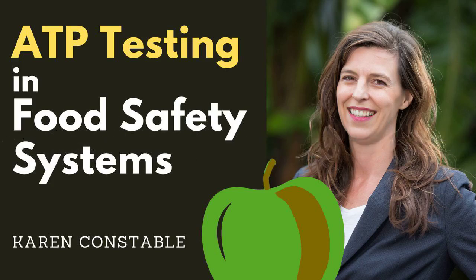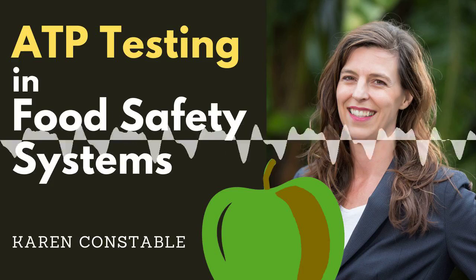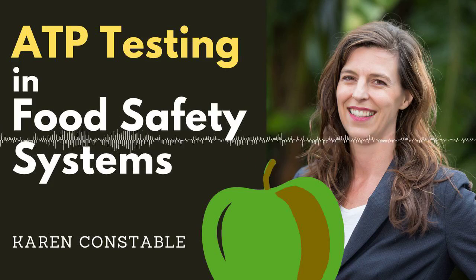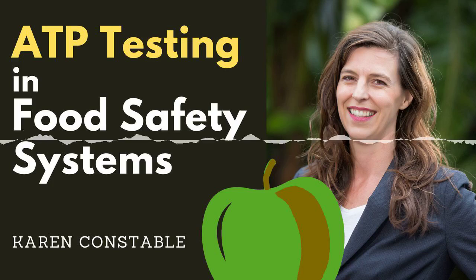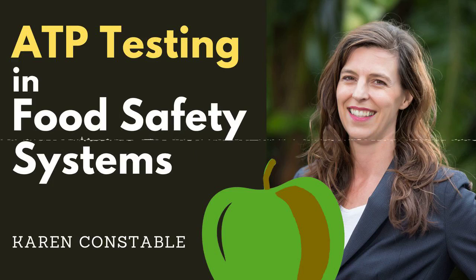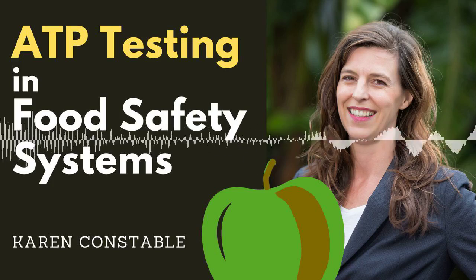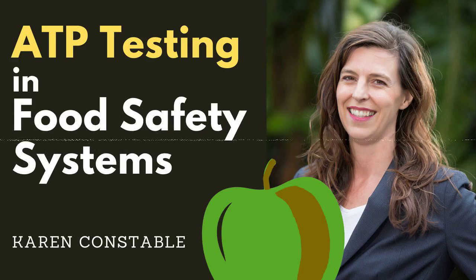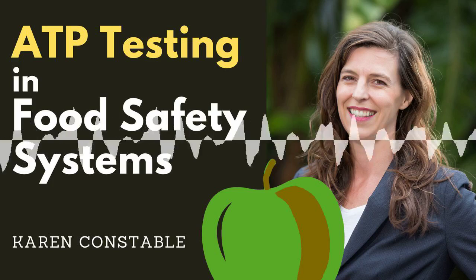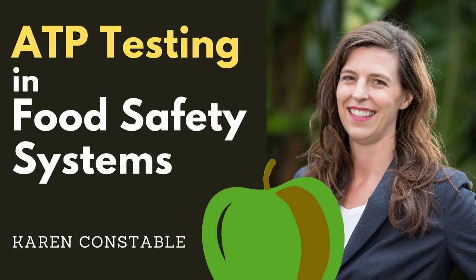What ATP tests can do: indicate the presence of organic material on a surface, monitor the effectiveness of cleaning and sanitation processes, provide almost instant results so corrective actions can be taken immediately, enhance training of cleaning staff because results provide an objective and instant measure of success, aid deep cleaning processes such as when disassembling machinery to identify problem areas.